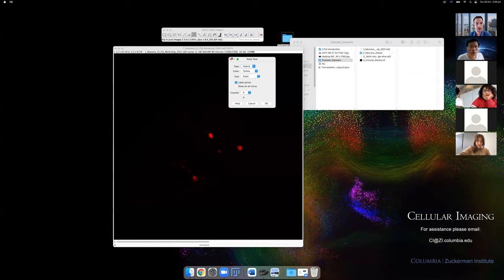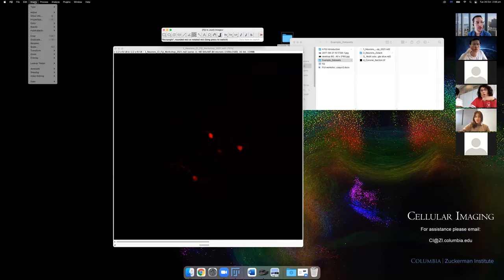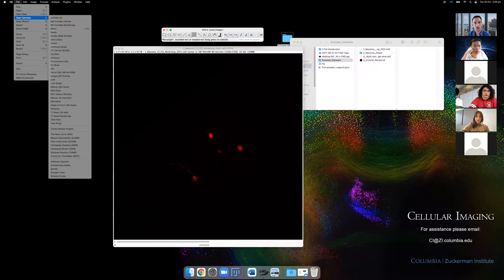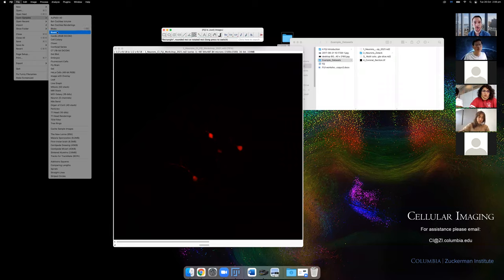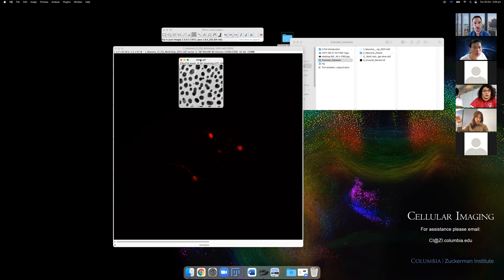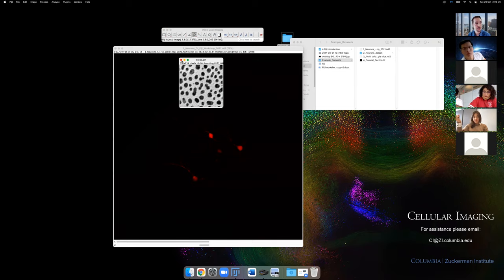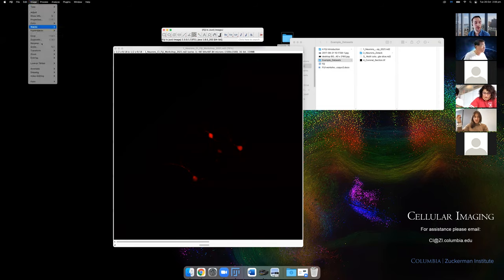We'll cover the wand and quick selection tools later. In the menus there are a lot of useful things — ImageJ actually has a whole lot of example data built in. If you're just trying to understand how something works, a useful one is the blobs image — a small image you can test object detection, filtering, and things like that. It's also useful if you're trying to get a script to work.